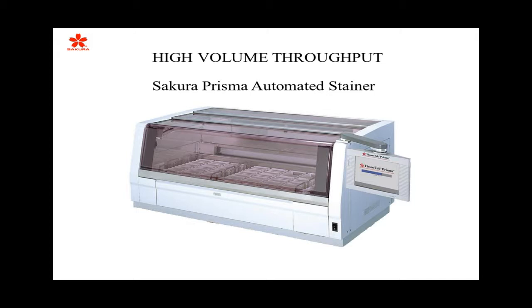So I really wanted to just touch on the point that I really don't agree with the idea that these type of stainers, these dip and dunk stainers, are not really good and promote floaters. If you're having a problem with floaters, it's probably 90% of the time coming from some other area other than staining. If you think it might be coming from your staining area, then increase the rinse rate that you have on your stainers. So I just wanted to dispel that myth about these type of stainers not being that good for staining because they promote floaters.